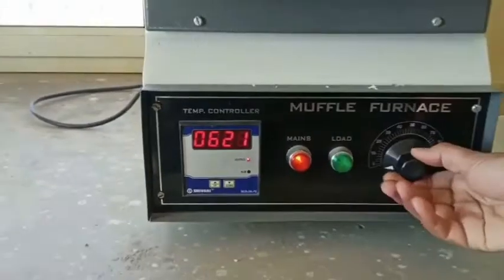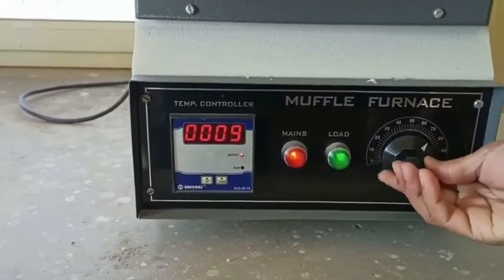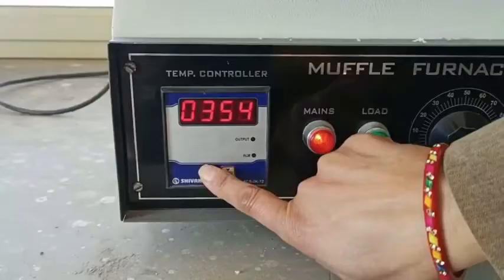Now we put on the mains and we set the temperature for output. I started this — you can see the green light — and here is the temperature of this muffle furnace. Let it be at that temperature for 5 to 10 minutes, or whatever is prescribed for your experiment.